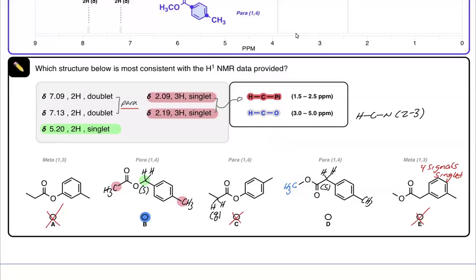Okay, so be prepared for a question type like this potentially. We read downfield to upfield, and you want to acknowledge these subtleties in chemical shift region because that likely will be the distinguishing factor that it will come down to as you problem solve.